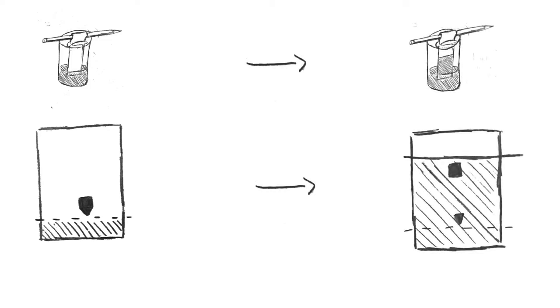Remember, we dip the paper into the liquid. The dotted line just represents where we stop submerging the paper. Anything below the dotted line is wet and is represented by diagonal lines since it's been dipped into the liquid. Again, let us pretend some time has passed and the liquid has moved upward. Now, pay attention to the image on the bottom right. This is the paper after the water has moved upwards. The line here represents where the liquid has stopped moving due to gravity.